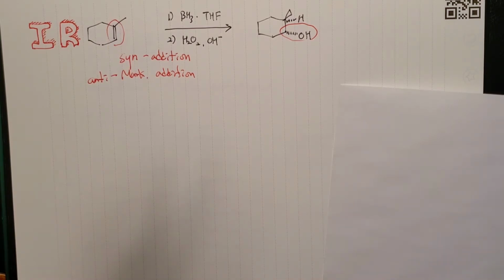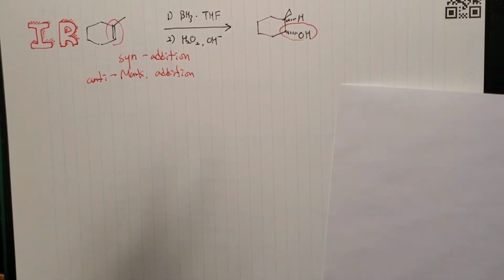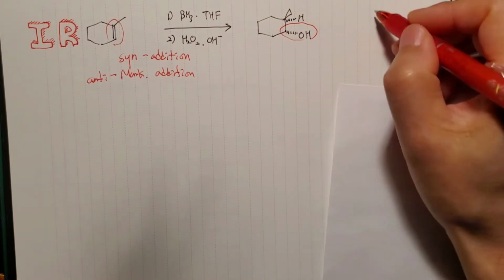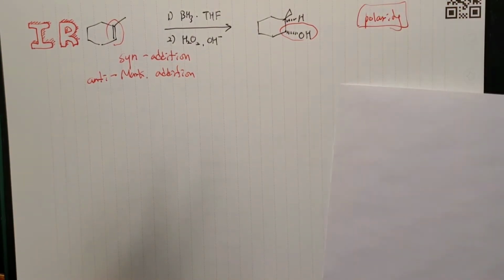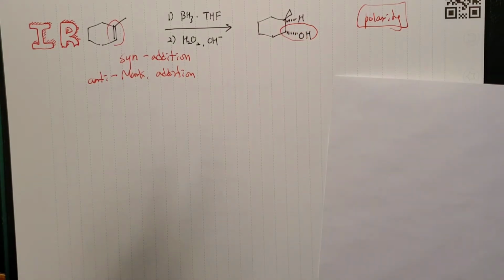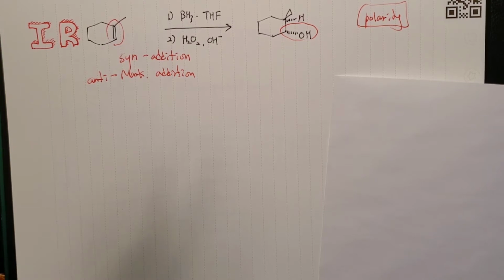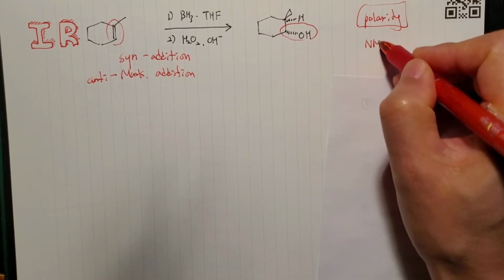But if you want to know more details about other parts of the molecule, then in the IR you need a polarity to detect easily with the IR. Another part of the molecule, they're not as polar, so getting information about other parts with the IR is not as easy, and thus IR is not as useful. That's when you need other instruments such as an NMR.